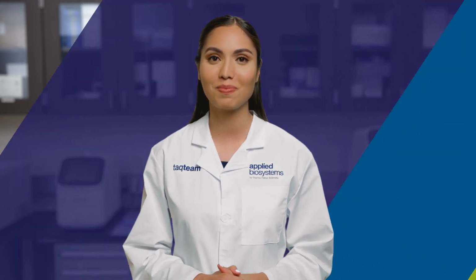So, what happens if my efficiency is 150%? Your first thought might be, wow, my assay rocks. That's good, right? Well, actually, no. It is not possible to be over 100% efficient, so something else is going on here. Let's review some causes of high and low efficiency and how to fix them.